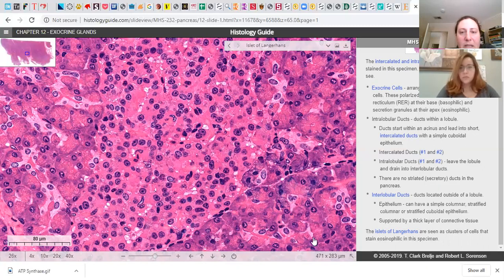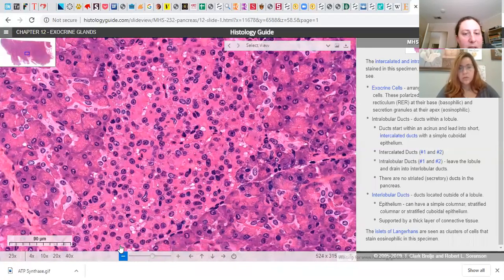So most of the cells that you can see here are acinar cells, and then these paler pink ones again are the duct cells. So they're the ones secreting the bicarbonate and the watery portion of the pancreatic juice. And then this is an example of the endocrine. This is the most rare portion, and can be a little hard to find sometimes.